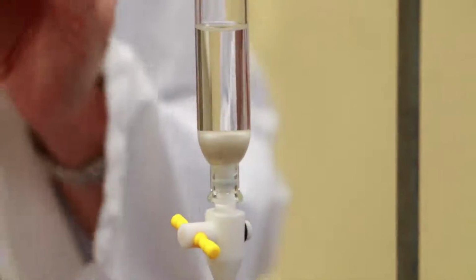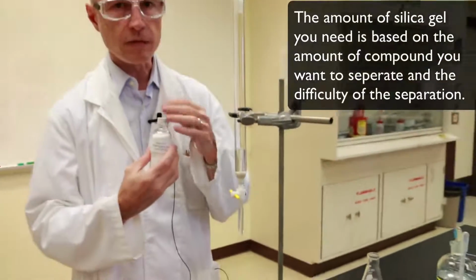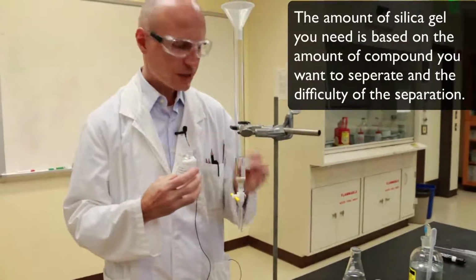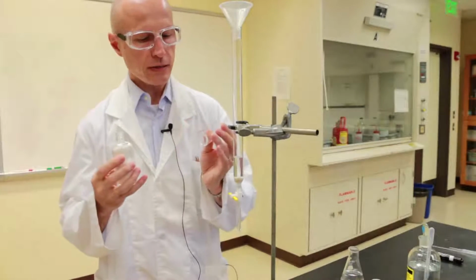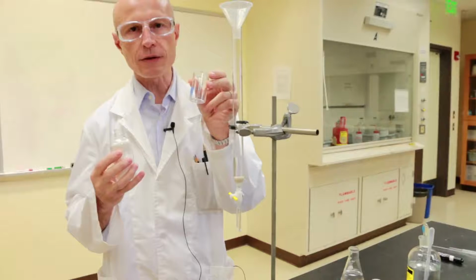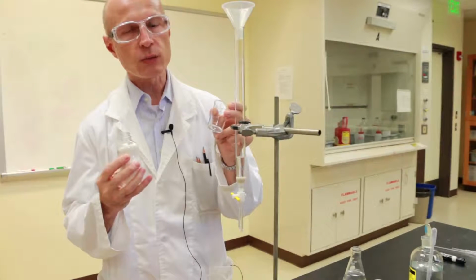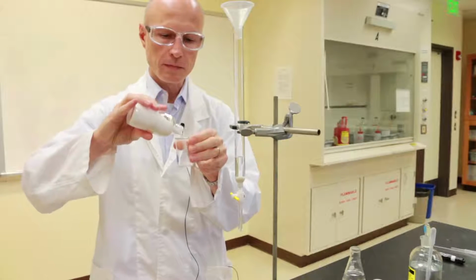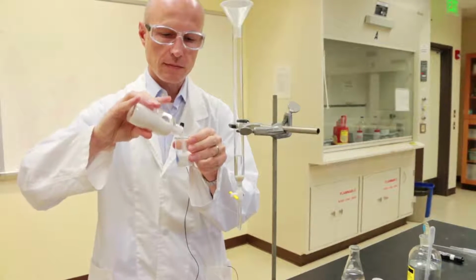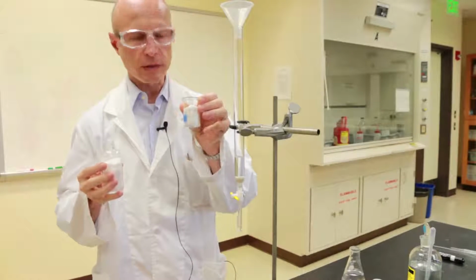You will need approximately 14 grams of silica gel. Dry silica gel has a density of about 0.5, so there's no need to really weigh it. It's going to be approximately 28 milliliters. So if you use a 30 milliliter beaker and you go somewhere in between 25 and 30, that is plenty accurate. So that's what we are going to do. That's approximately the right amount.